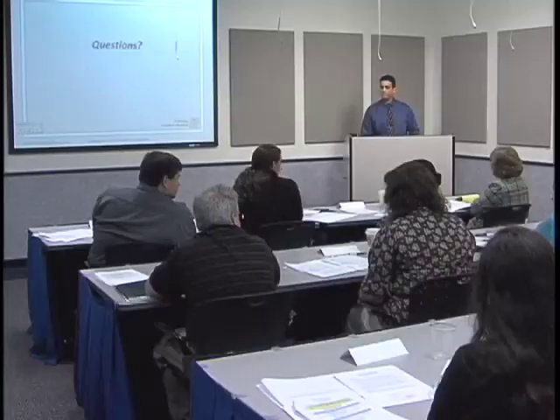And as for the mixtures, right now we've decided to try to use the data for exclusionary purposes and not really worry about trying to include somebody with those lower level ones. Like most labs, we're getting a lot of that kind of stuff, and right now we don't do anything with it. We just say we can't make any kind of conclusion, so we're hoping to make at least the leap to being able to exclude somebody from a particular sample where before we weren't able to say anything. So that's where we are now, trying to figure out what we want to do and start writing our policies and getting them in place.